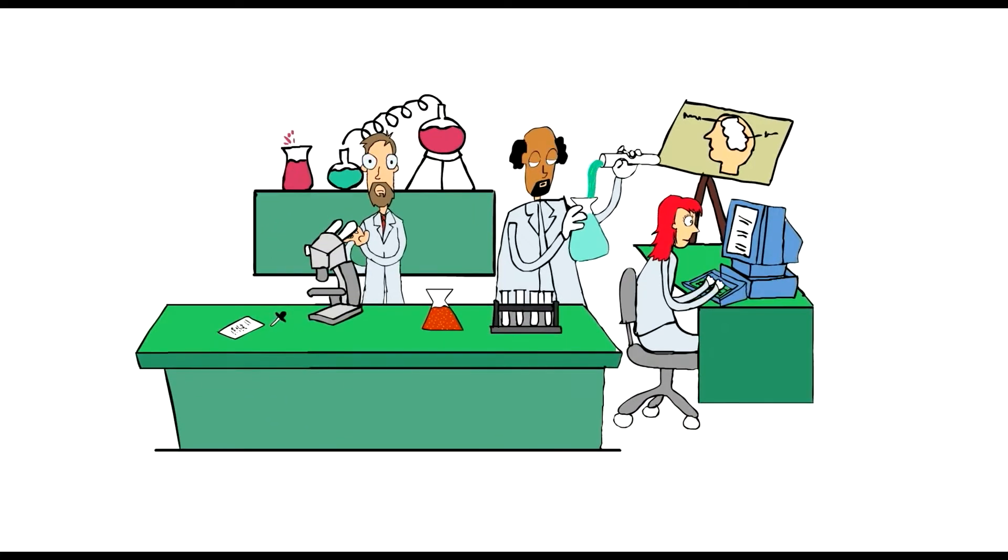Here at the Pharmaceutical Research Facility, scientists are hard at work attempting to come up with the next wonder drug.